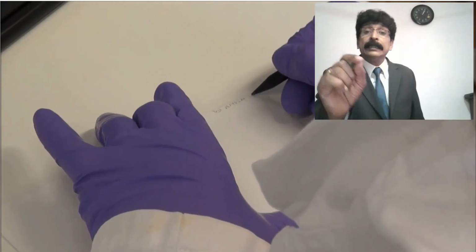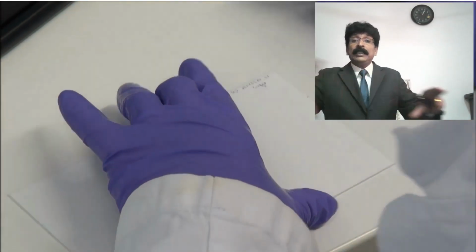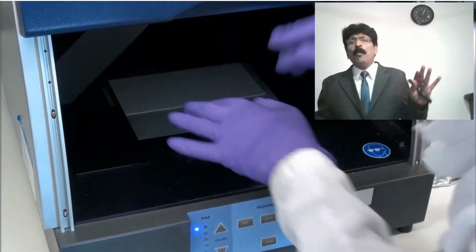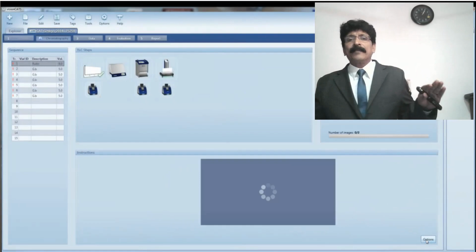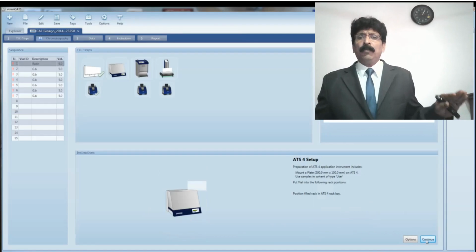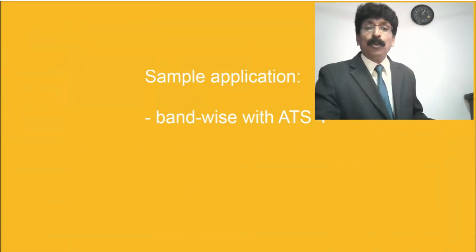Afterwards she comes to write on the plate also. See, on the plate, you see the plate size, it's not like what you did in the lab. It's a square type and kept inside. Now no sampling has been done, only you are going to see the picture of the empty HPTLC plate before performing. Is there any dirt or anything? You can see. Now you are going to sample.